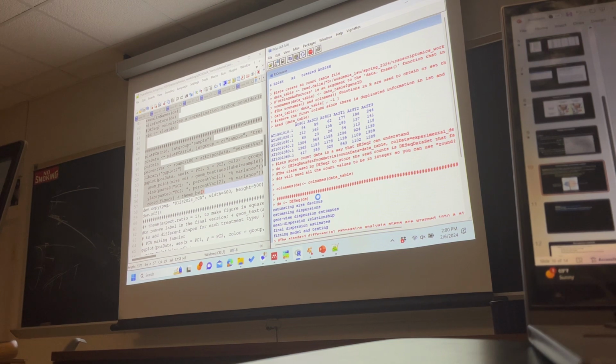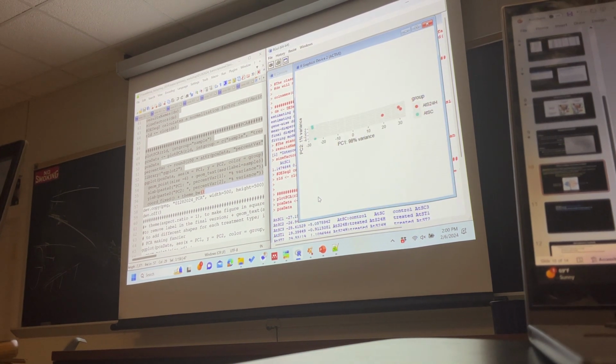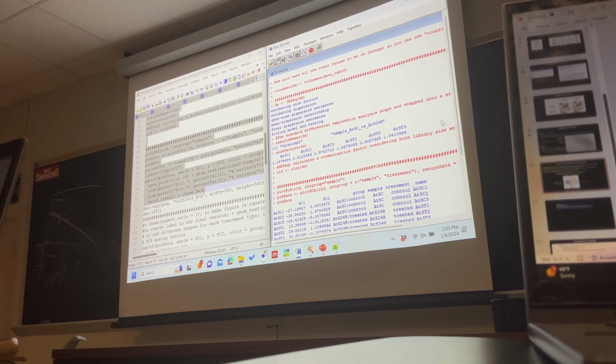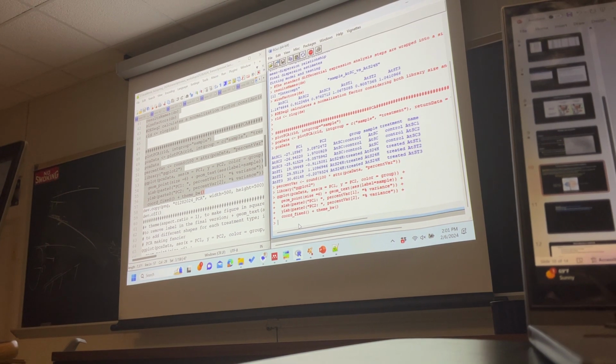Again, when you are making the final set of figures for your manuscript that involves some RNA-seq dataset, there are a lot of resources available online nowadays, right? So just try to use those resources to make really good quality figures.